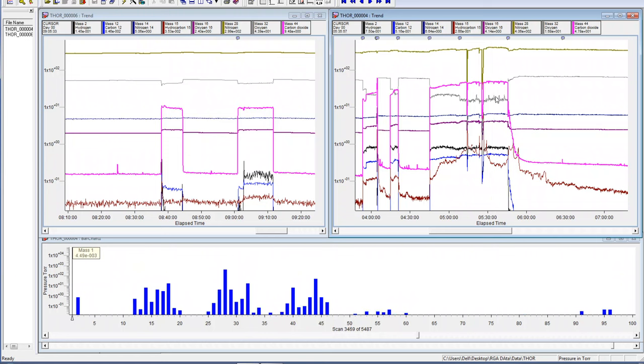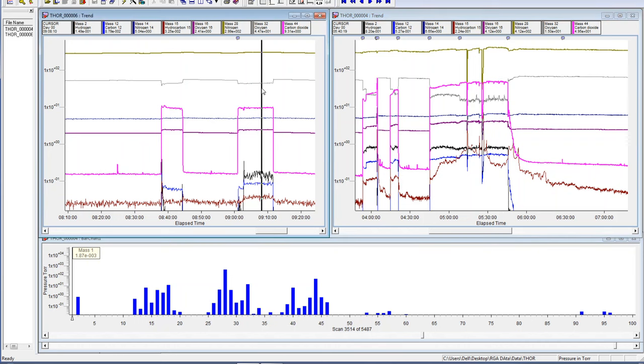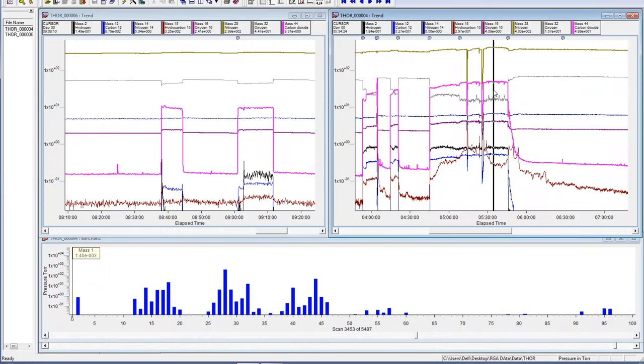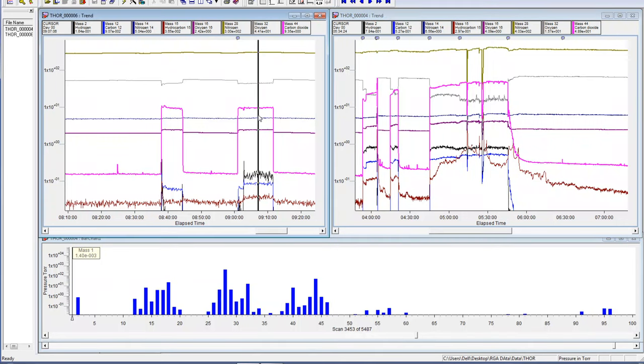Here the oxygen is only 1.5 to the plus one. The oxygen here is 4.47 to the plus one. The oxygen is 2.41 to the plus zero and here the oxygen is 4.09 to the plus zero. How does that make sense?